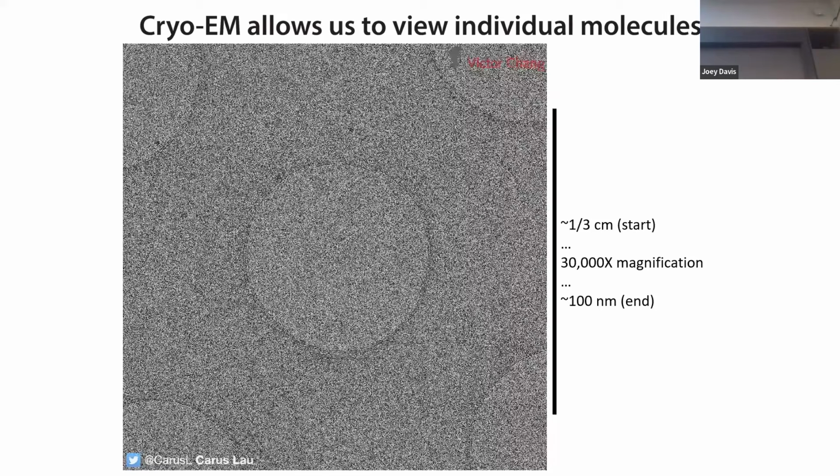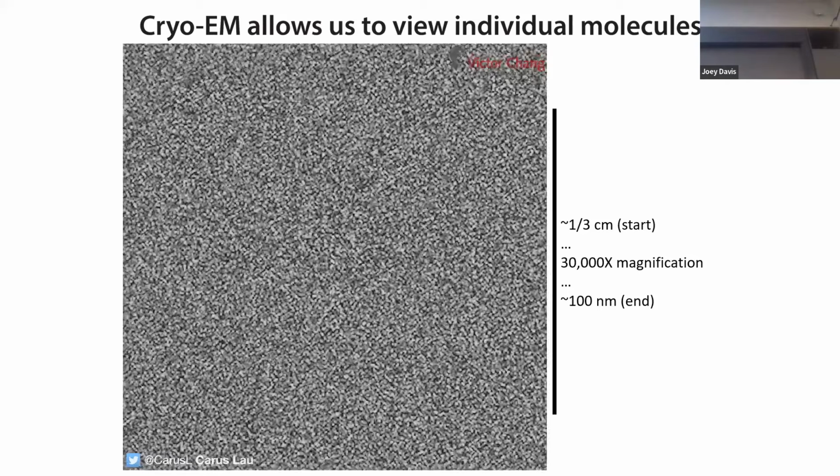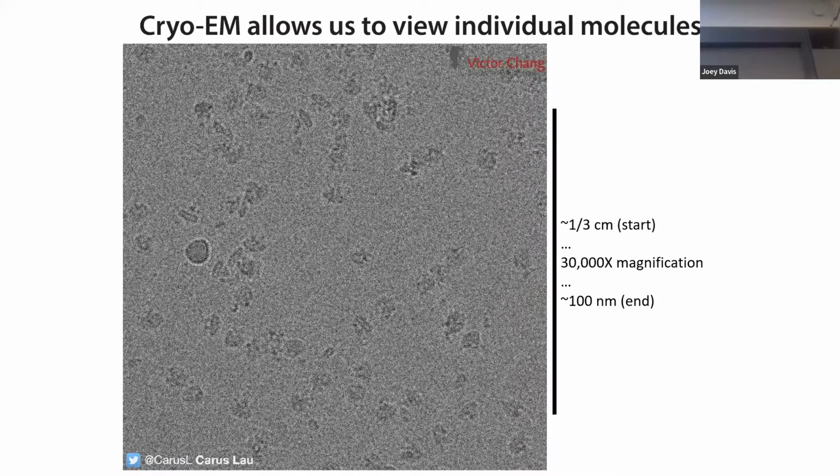Slowly get to. And then we're going to low pass filter the image. And you start to see these individual molecules. All right, so this is a single molecule approach. We can actually see individual molecules. Each one of them is this unique, beautiful snowflake, each in its own conformation, but they're really bad snowflakes, right? The signal to noise is terrible. It's very hard to see each one.